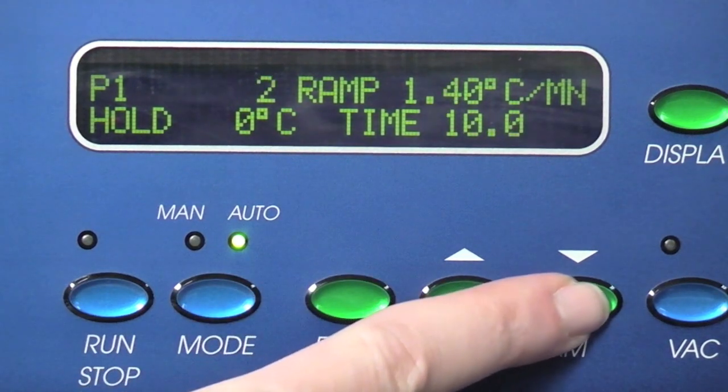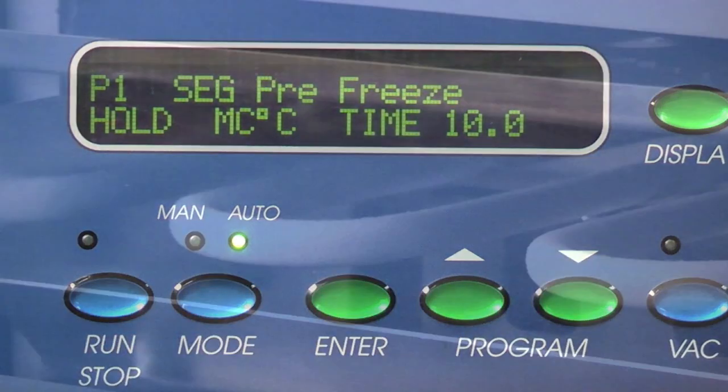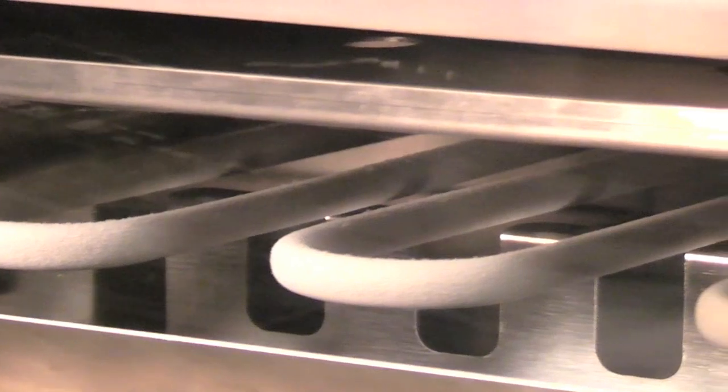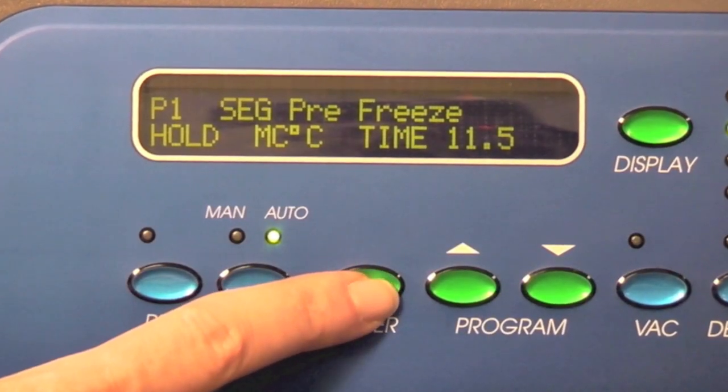Use the up or down button to get to pre-freeze. In this segment, the shelves automatically cool to max cold, or minus 75 degrees. Press enter and set the time to 12 hours.